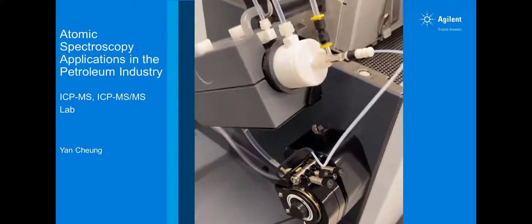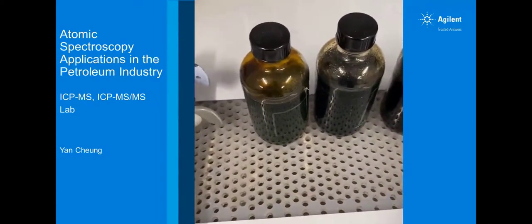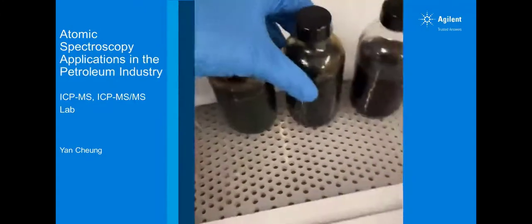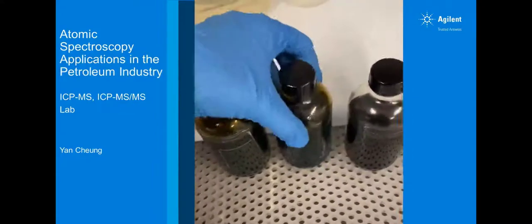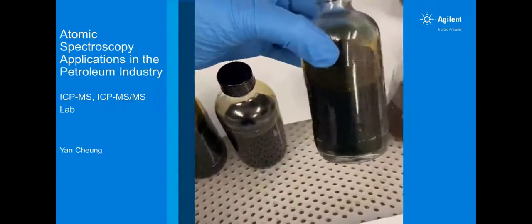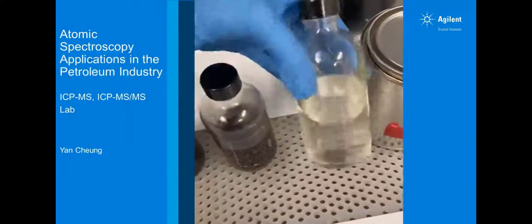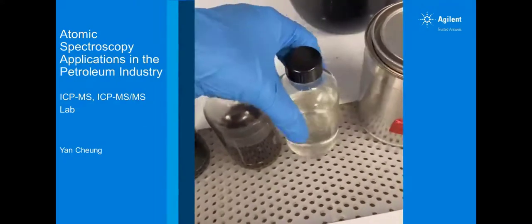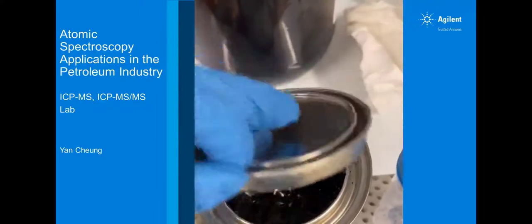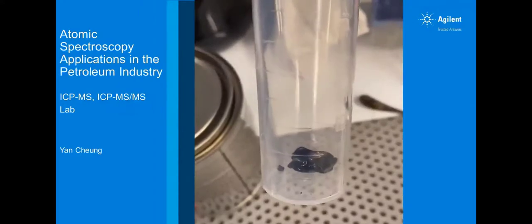Now let me take you over to look at some of the samples I'm working on today. I wanted to show some of the samples that I will be running in the single quad ICP-MS today. So here you can see that I have some pretty waxy sample, some dark lube oil type of sample, another oil sample a little lighter. This one is a little thicker. I would guess these are the oil feed, and this one is quite a bit lighter, and we have some gasoline and naphtha range sample. Over here we have the really difficult nasty ones that all the analysts dislike, and they can actually be chipped out, a really hard, tarry looking sample.